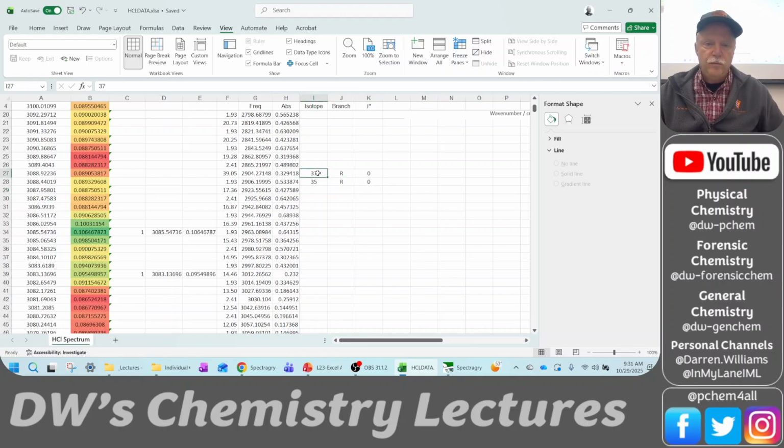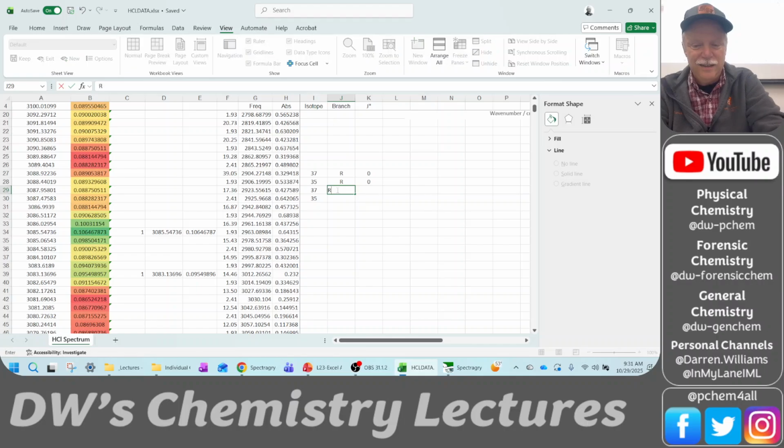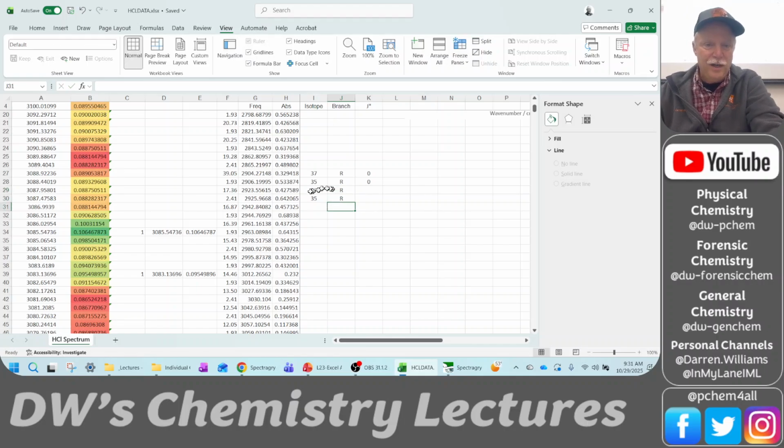And so then we have that same repeating pattern, 35, 37. Oh, that didn't work. We'll have to do it by hand. Okay. This is R, R. We're going up in value, so this is going to be the R1. So you see we're assigning the quantum numbers, the R branch, and the isotopes to all of these lines. And that's all you got to do to assign your spectrum.